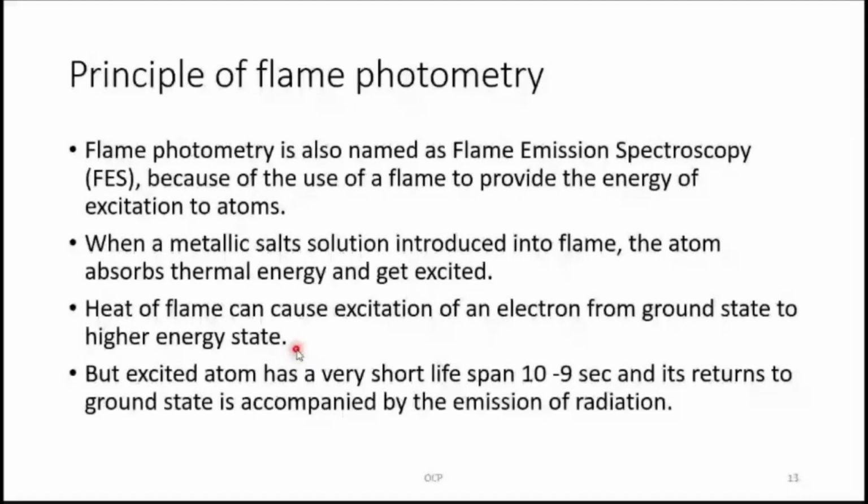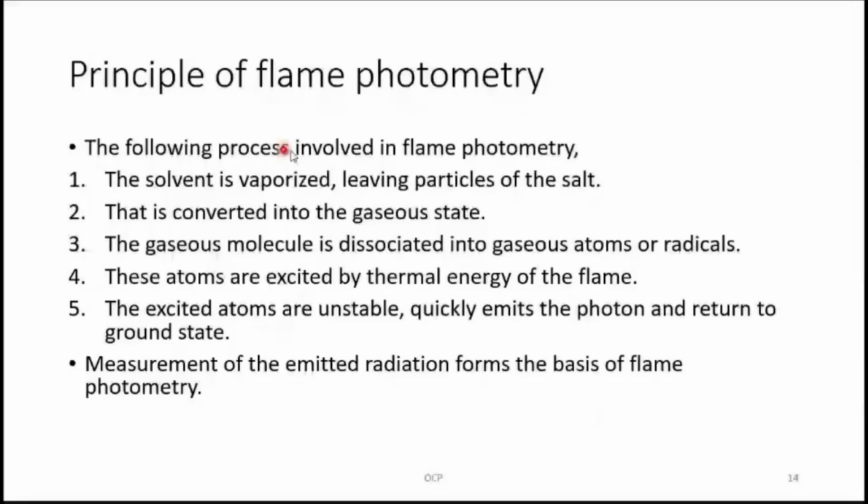But an excited atom has a very short lifespan, 10 raised to minus 9 seconds, and its return to the ground state is accompanied by emission of radiation. So when that high energy electron comes to the ground state, it emits a photon. The following processes are involved in flame photometry.